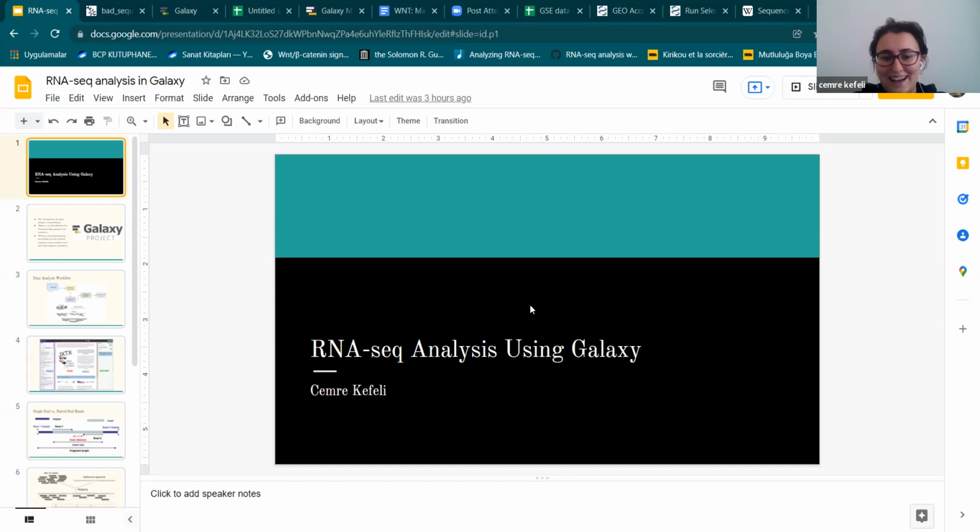Okay. Hi, everybody. Today I will talk to you about RNA-seq, how to analyze them in Galaxy. I will not make the screen big, because I will jump into the other tabs quite frequently.